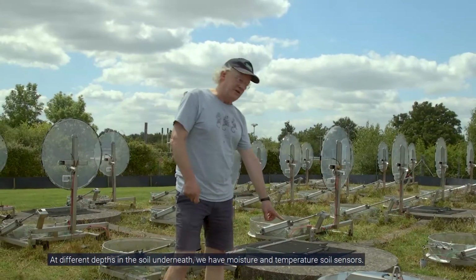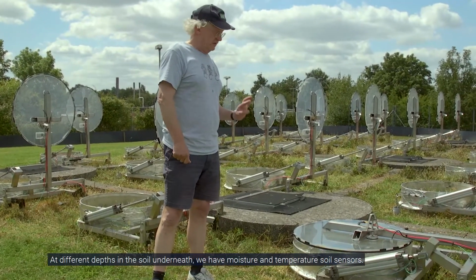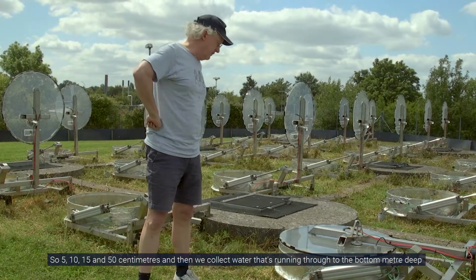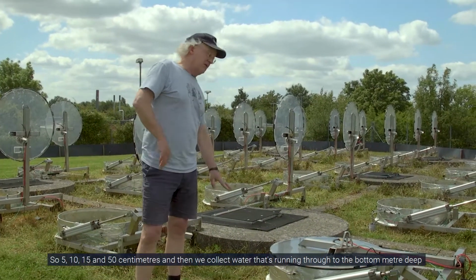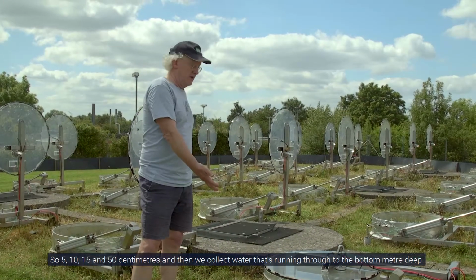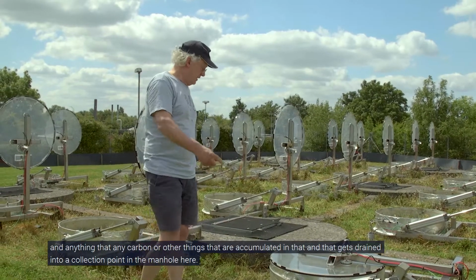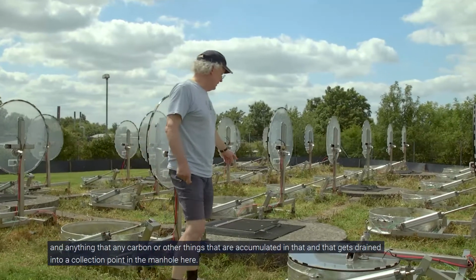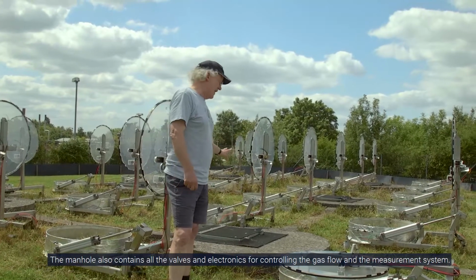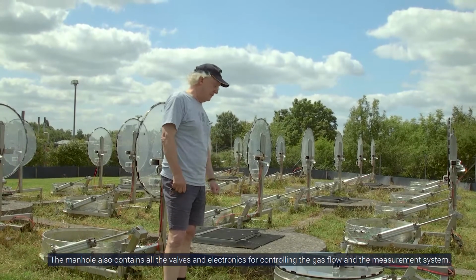At different depths in the soil underneath, we have moisture and temperature sensors. So 5, 10, 15 and 50 centimetres, I think. And then we collect water that's running through to the bottom, a metre deep, and any carbon or other things that are accumulated in that. And that gets drained into a collection point in the manhole here. The manhole also contains all the valves and electronics for controlling the gas flow and the measurement system.